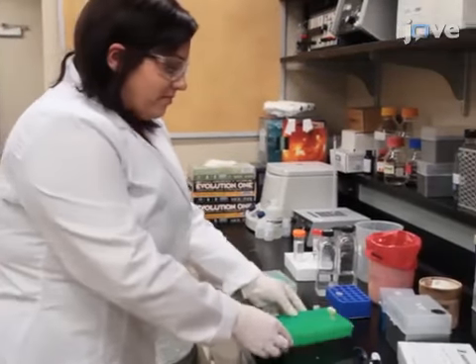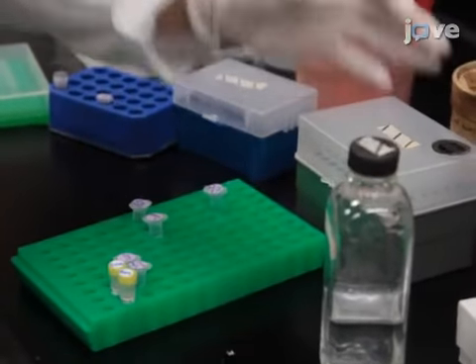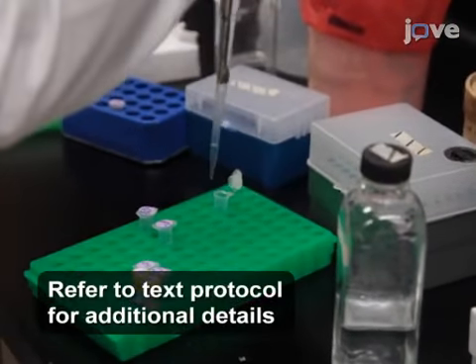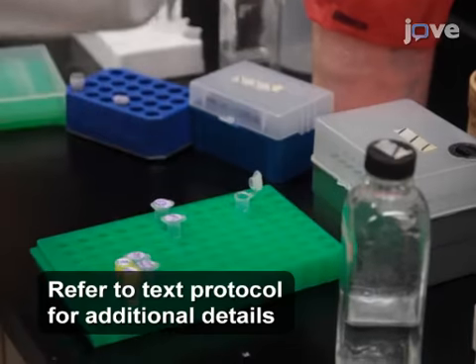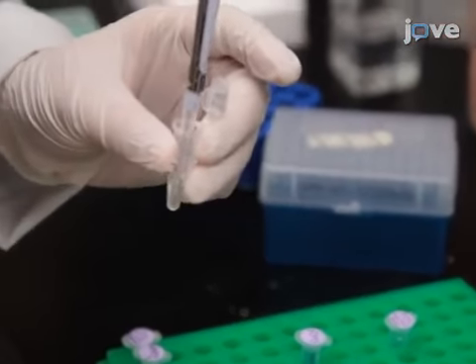After designing primers according to the text protocol, to prepare 500 microliters of a master mix for PCR, combine 320 microliters of sterile water, 50 microliters of PCR buffer, and 20 microliters of dNTPs.